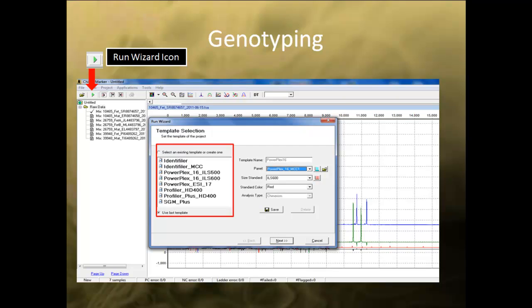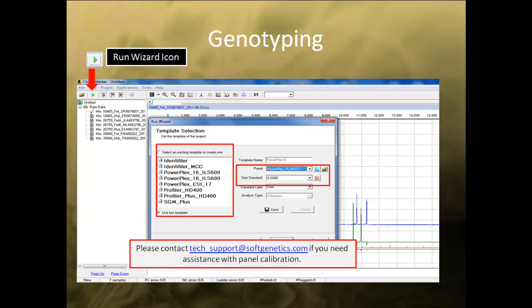In the first dialog box, you can either choose an existing template for the chemistry you are using, create a new template, or just run the analysis normally by choosing the panel and size standard from the drop-down list. In order to successfully complete the analysis, the panel must be calibrated to your specific instrument. If you have any questions concerning panel calibration, please contact techsupport at softgenetics.com.